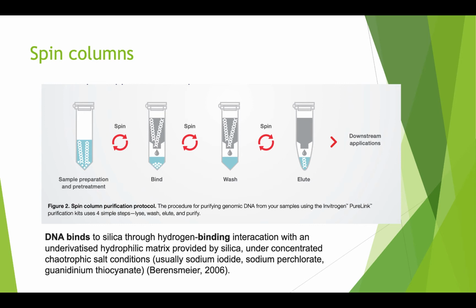This underivatized hydrophilic matrix provided by the silica and whatever. But if you open papers again, you will find other explanations. So the DNA binds to the silica, these silica columns.